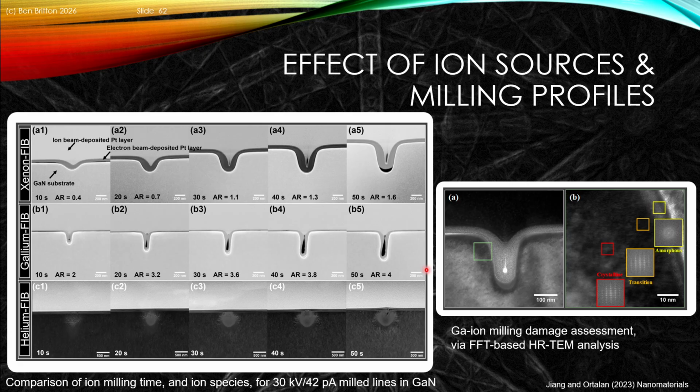We see this in particular if we are playing with different FIB types, we'll get effectively different impact on our material, and we can see that associated with the damage below the cutting surfaces here. And we see this as we look from the amorphous to the transition region into the crystalline subsurface. And again, some beautiful work presented here.